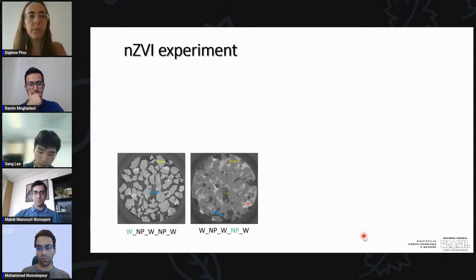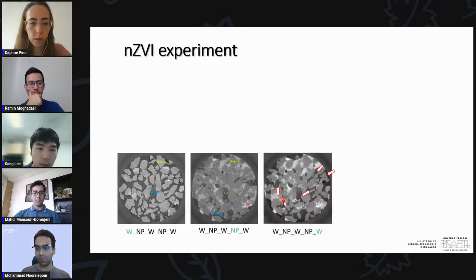So this is the kind of image that we get from our detector. And what we do is segment, we separate those phases, so we can calculate volumes, we can calculate surface contents, basically anything you can think of. And we can also perform permeability experiments once we have the data regarding porosity on each one of them.